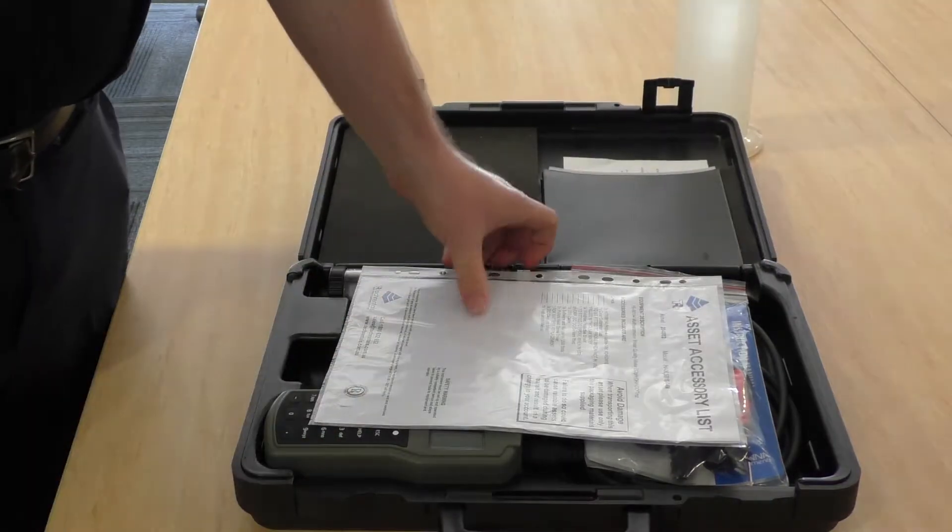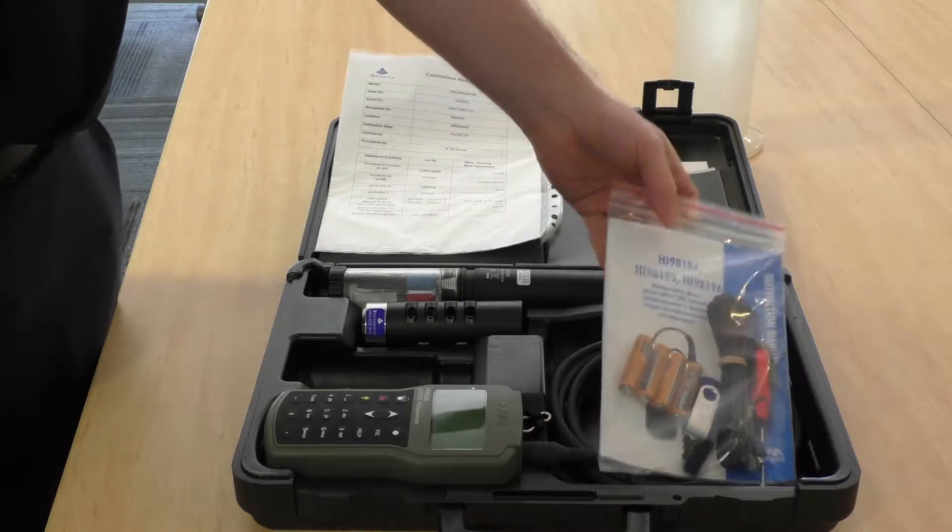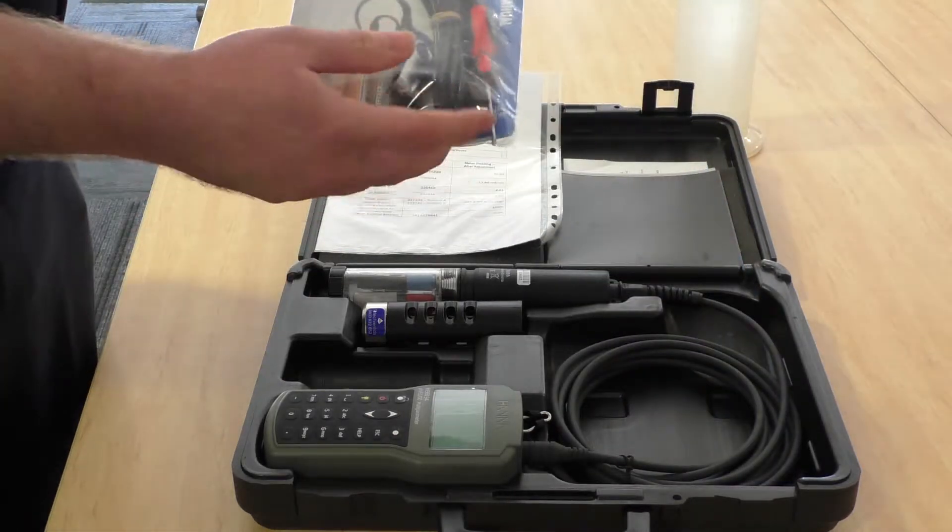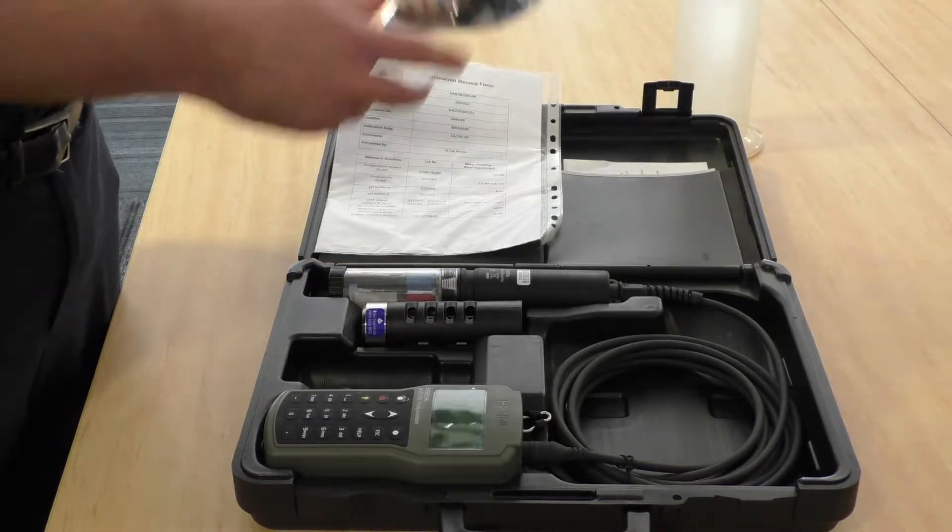Opening up the meter, it comes with the accessory list, calibration record, spare batteries, screwdriver to help you change them, the software's on a USB stick, the manual and a USB cable.